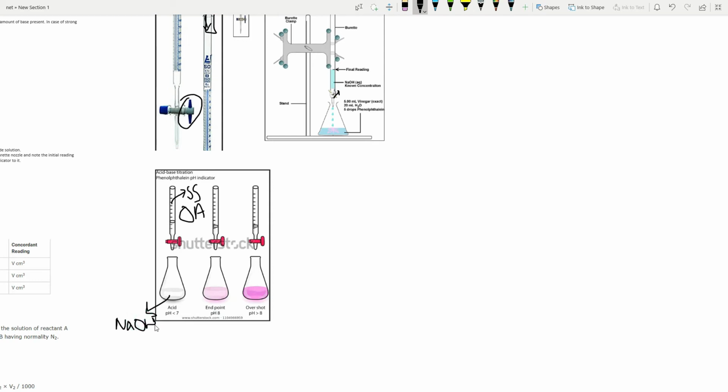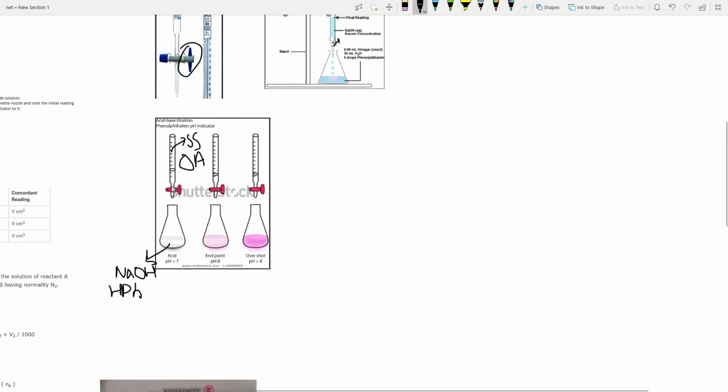We have used phenolphthalein in this. So this is a solution of NaOH and phenolphthalein. Drop by drop it is going down, and when it reaches a very light pink, you're going to shake this, so that it will not be concentrated on one point. You shake this, that means you're mixing it, and it becomes a very light pink color.